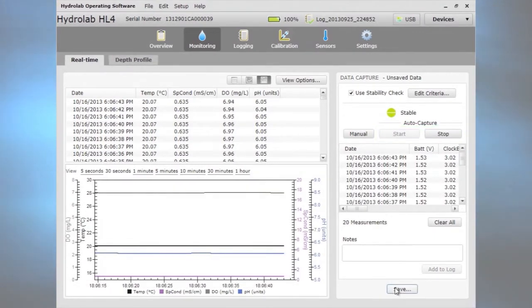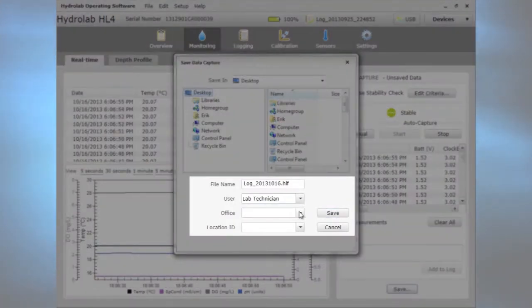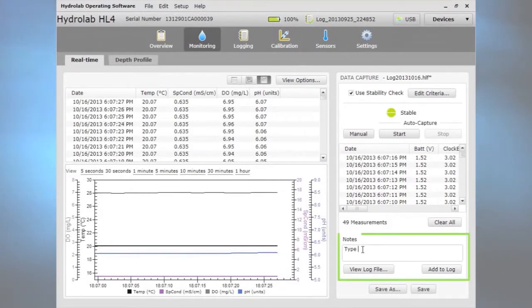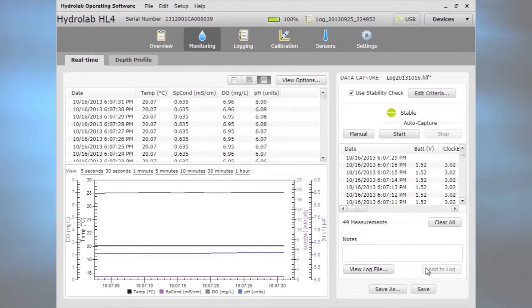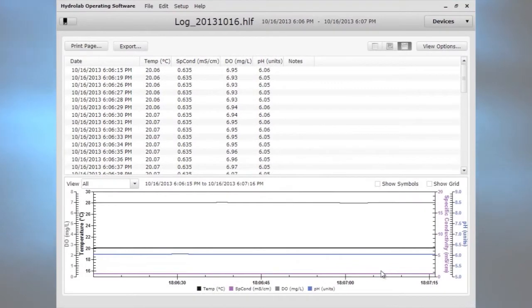Save data to a log file and include user and location information for additional metadata. Add notes to the log file for important information about the sampling event. The log file is available for viewing where it can be exported to be saved to another location.